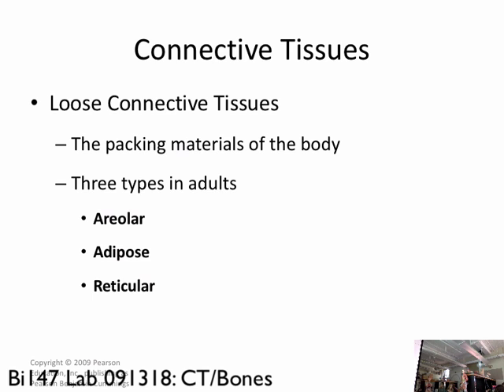Is that the same as this dense regular connective? Nope. So these are loose connective tissues. As soon as I'm done, I'm going to get to dense connective tissues. So in general, yes, ma'am. Let's do it. So you say in adults, you're talking about... Children have all of these, but children have stem cell populations that adults don't have.